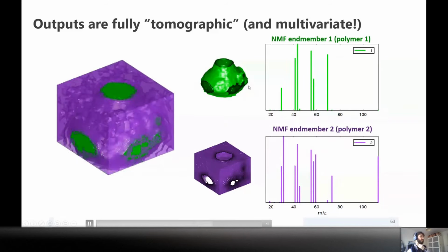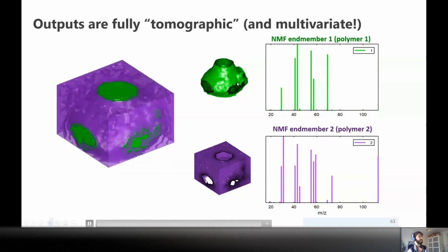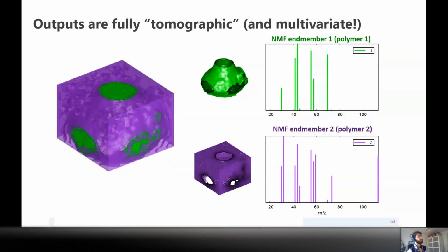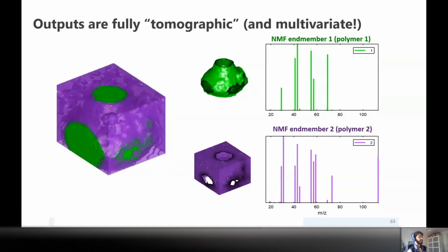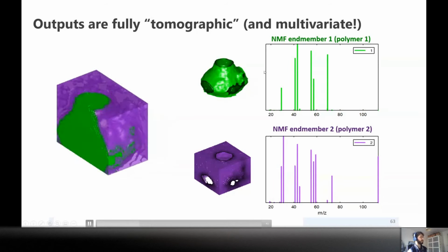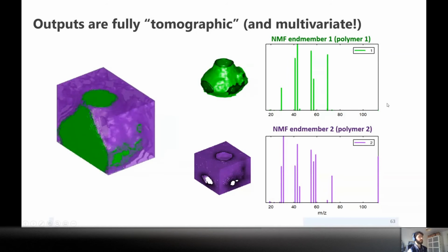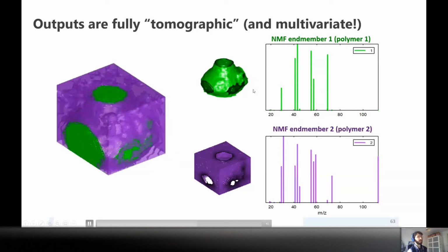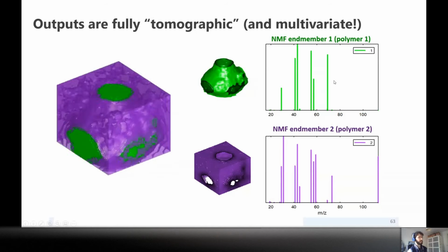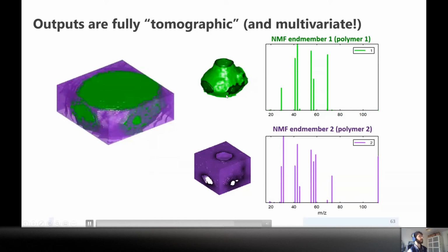So when we do the practical thing with SIMS, we can show you how to do this. But it's quite useful to show your 3D data with this kind of rendering. So you can show different levels. It's more technical, but sometimes to convey the idea or show a nice slide, it's good to have this 3D rendering of your results. And again, if you do it for the original ones, sometimes it's too noisy, it won't look as good. When you do it after NMF, you're joining peaks together, so you're enhancing the signal to noise, and things will look much smoother and much better.